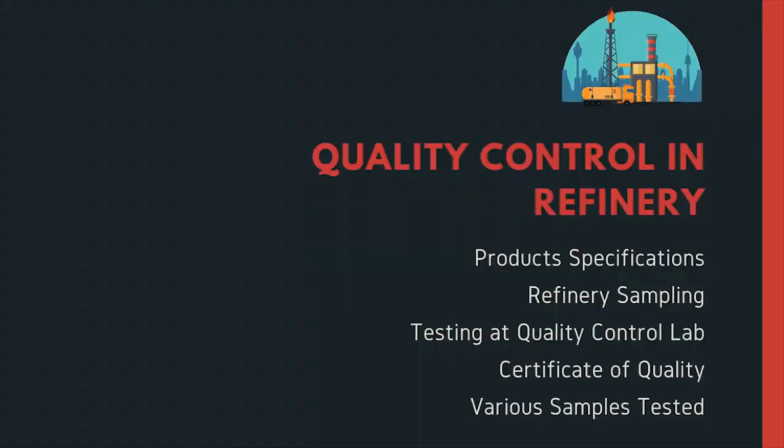In the previous episode, we have seen how various equipment are used and what the different maintenance strategies employed inside a refinery. Today, we are going to talk about the quality control aspects, how the quality of each product is determined with the help of a quality control laboratory.